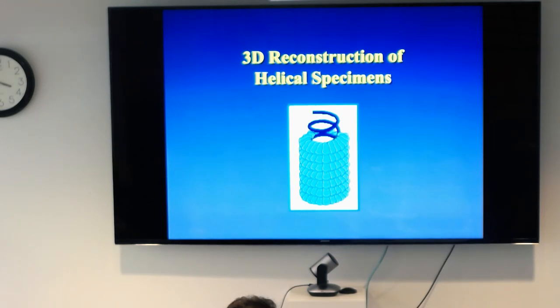So I try to focus here just on the basics. I understand most of you here, particularly the ones that are not here, say single particle, helical reconstruction, I don't care, I'm not going to use it. It's just single particle. It's kind of interesting historically because it used to be exactly the other way around.